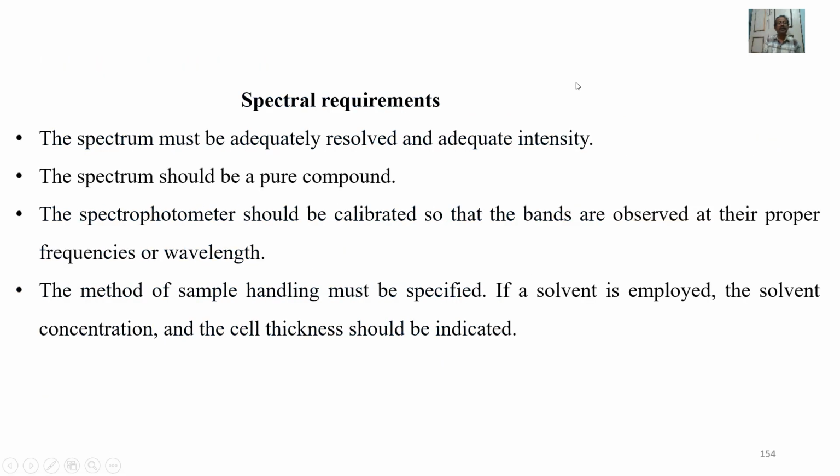So, spectral requirements. The spectrum must be adequately resolved and of adequate intensity. The spectrum should be of a pure compound. The spectrophotometer should be calibrated so that the bands are observed at their proper frequencies or wavelengths. The method of sample handling must be specified. If a solvent is employed, the solvent, concentration and the cell thickness should be identified.